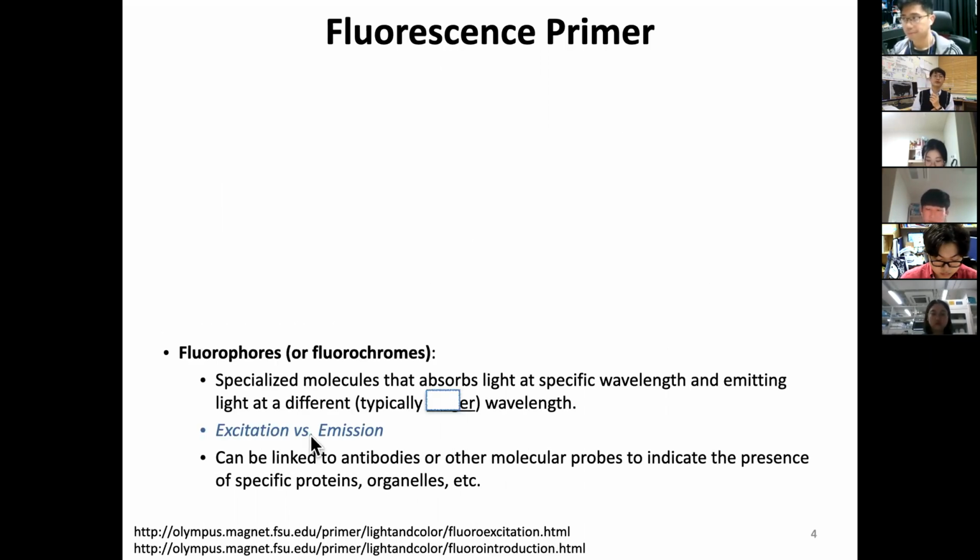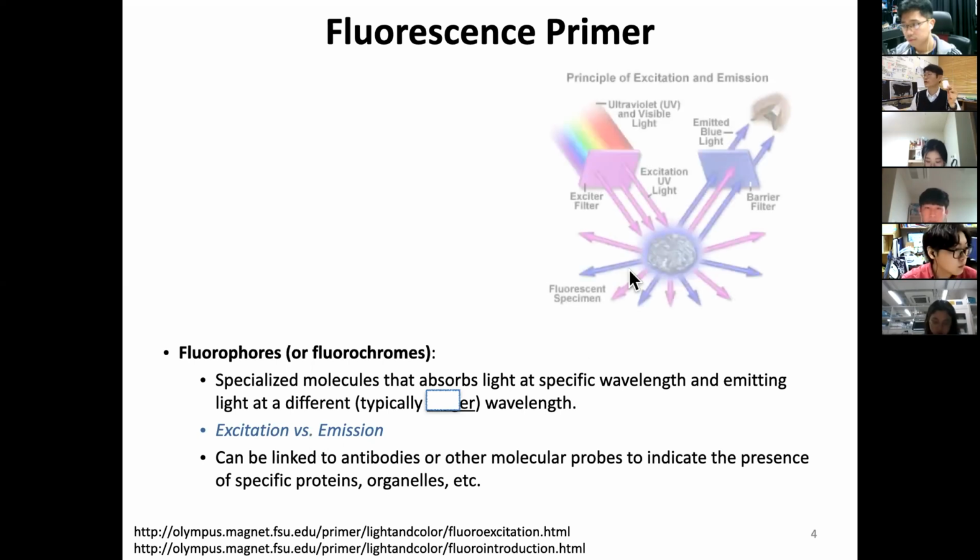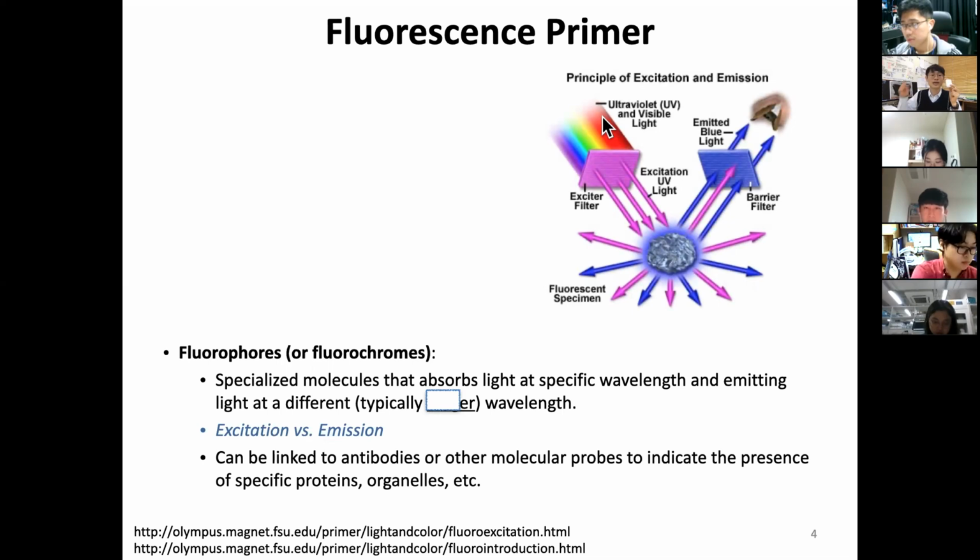All right, first of all, I want to discuss fluorescence. In the old days, people found a stone which has a special property. What kind of property is it? You use cellophane tape, like colored film, as a UV-passing filter to shine this stone with UV.